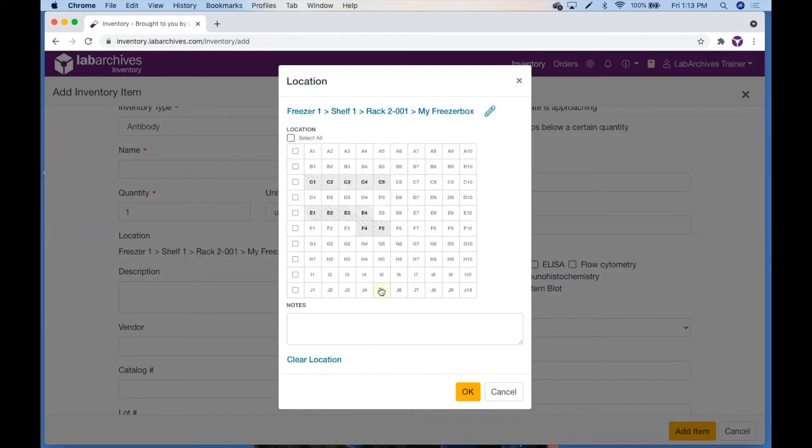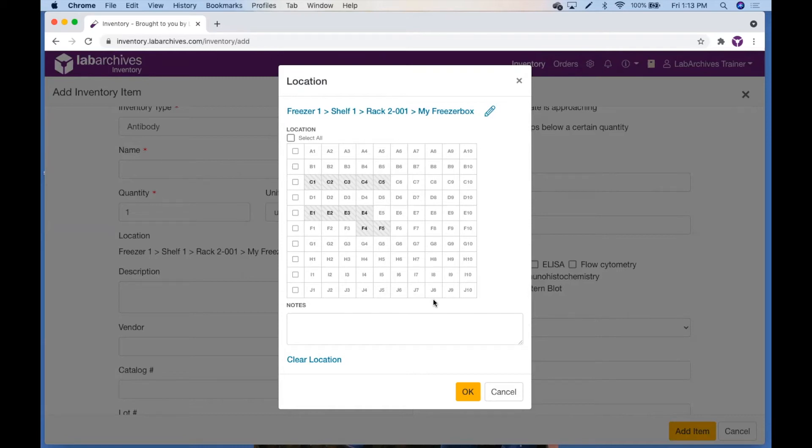If this item is located in a freezer box, follow the location hierarchy to this freezer box level. A grid for the freezer box will display and you can specify each cell where this item will be located. You also have the option to add a note for other lab members to see and then click OK.